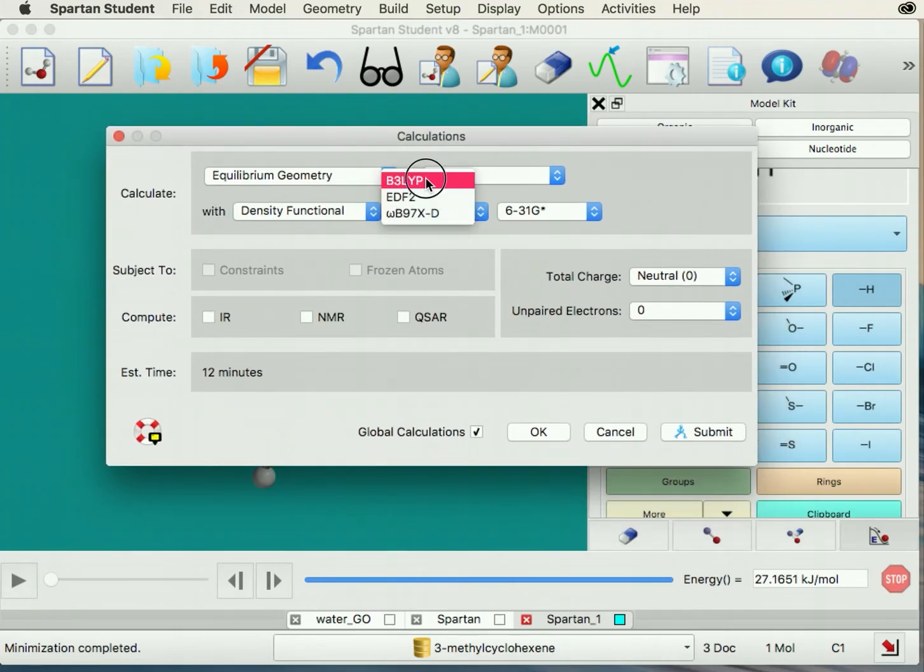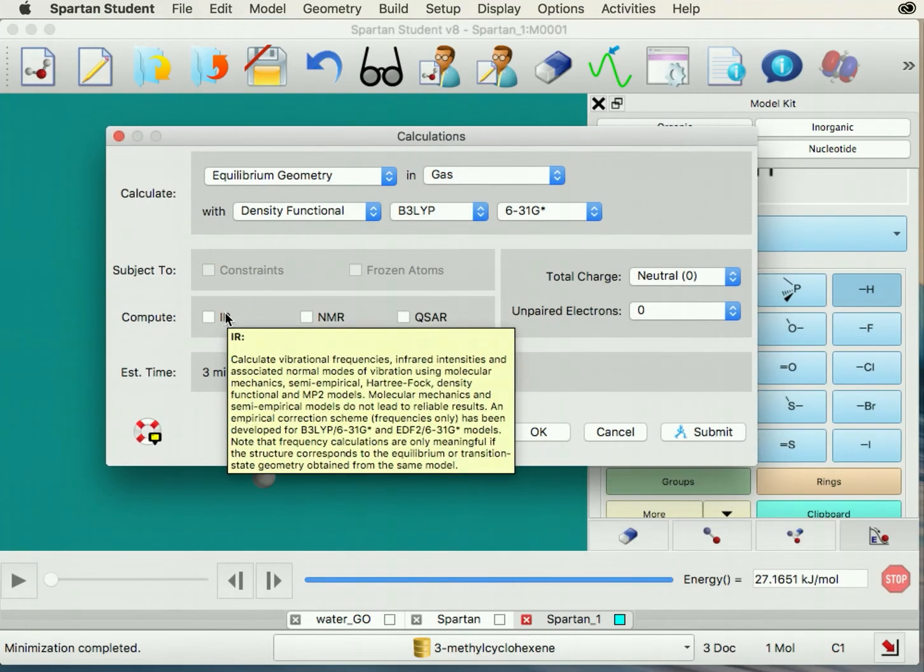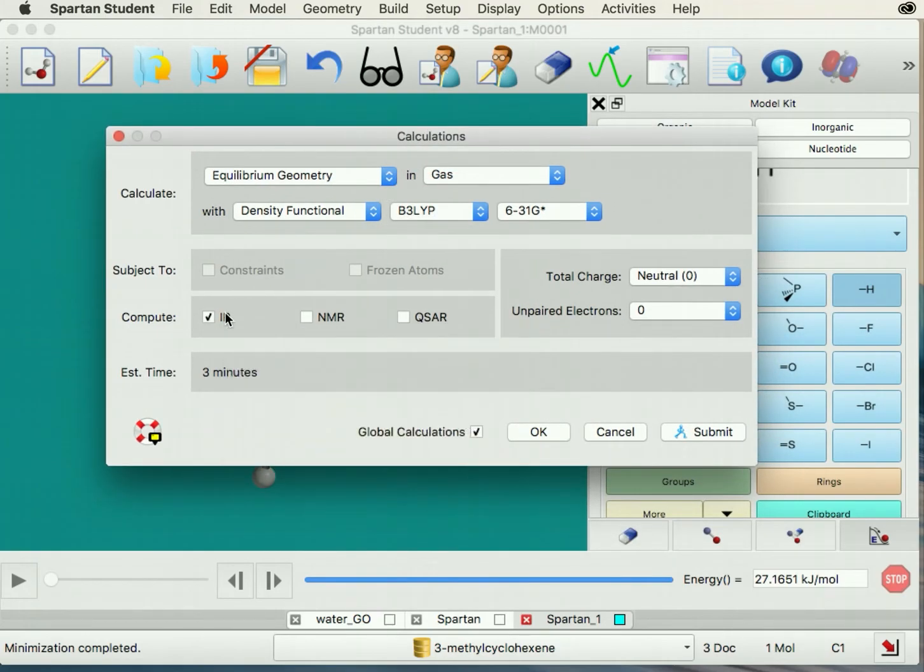Ensure that you select the correct settings and check the box next to IR, and click submit.